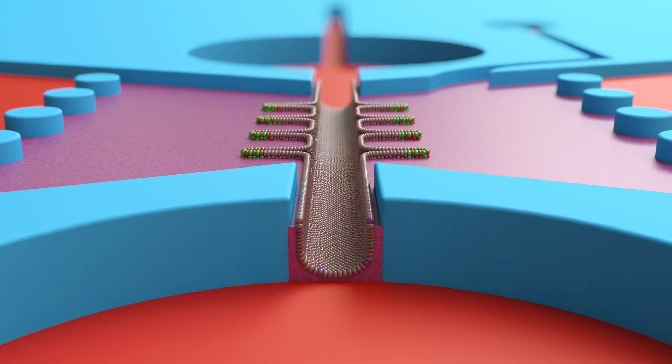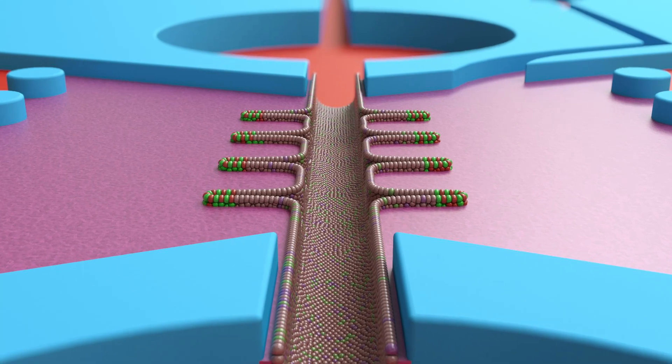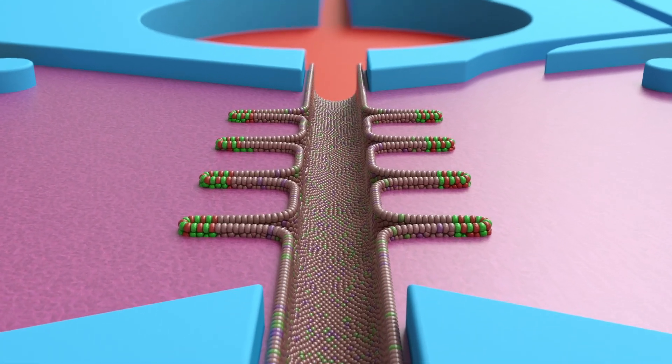The microfluidic chip is engineered to incorporate a gut-shaped micro channel within the 3D hydrogel to create the right environment for the cells.